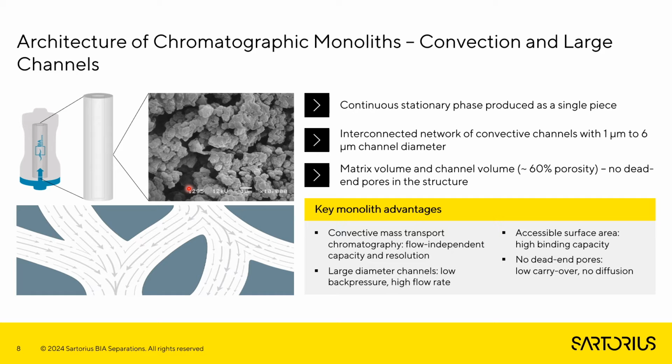Now, these channels provide us with, first of all, unobstructed flow for the large size of the molecules we're purifying. The channels themselves range in size from 1 to 6 micrometers in diameter, with distinct sizes determined based on the molecules that we're purifying. But the large channels also give us the advantage of having a low operating pressure. So with this low operating pressure combined with a good surface accessibility for the molecules we're purifying, we can intensify the purification of these large biomolecules.